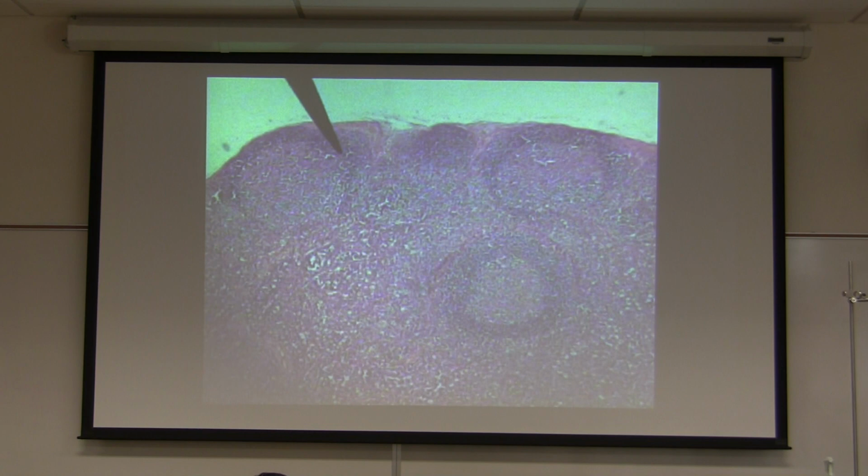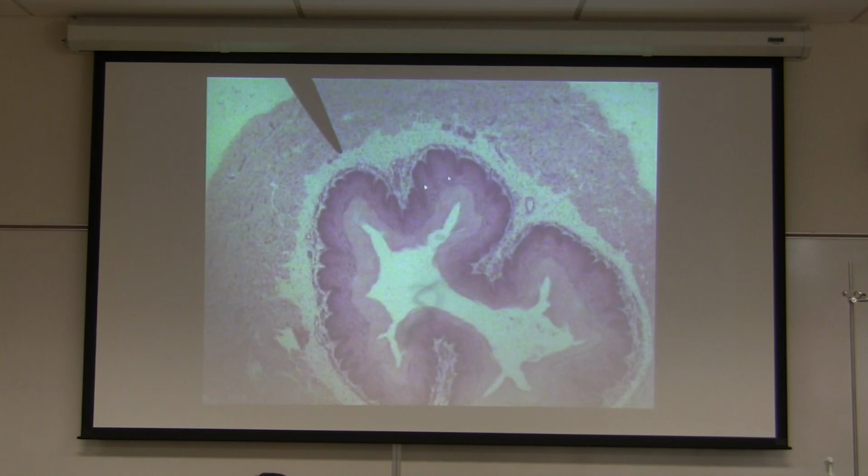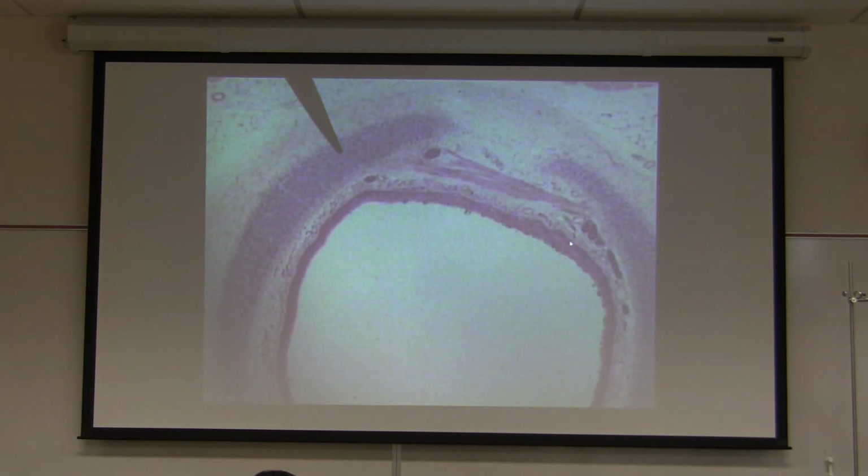Okay. What organ? Esophagus. Very good. What tissue? Stratified squamous epithelial tissue. This is not keratin, guys. Don't confuse it. That's mucus. All of that is mucus. And what organ is this? The C shape was cut off a little bit. That's trachea.